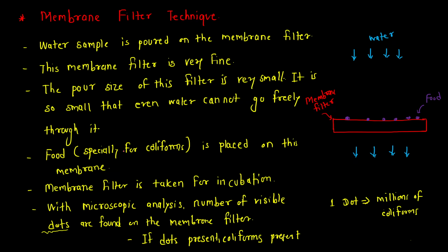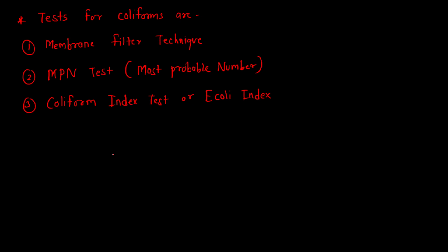So we have already completed the membrane filter technique. Now we'll be seeing the next technique, that is the MPN test, that is most probable number.